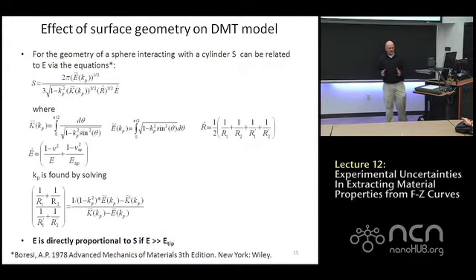It's not really a very physical quantity; it's just the way it goes when you work with these models. So you get your parameter Kp from the bottom equation, plug it into the top equation, and eventually relate S to another geometry term, the inverse reduced radius, and your inverse equivalent elastic constant, which are given by this term and this term.